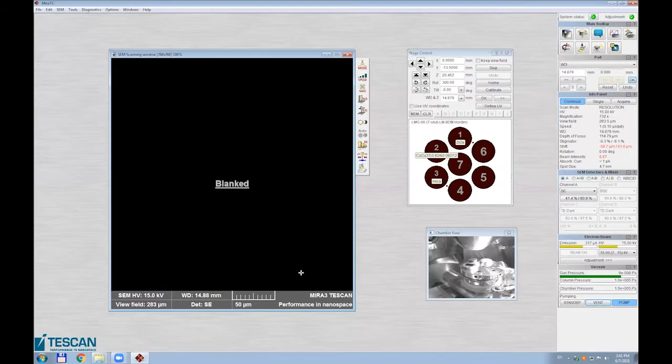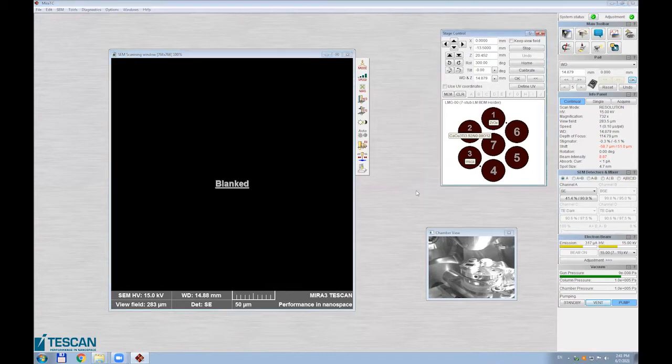And here we have the software. So it's really user-friendly. Here, it's your holder. You can name any of them, so you know in which position what you have. Now we are waiting for a vacuum.